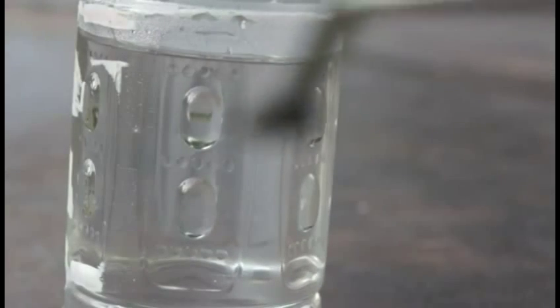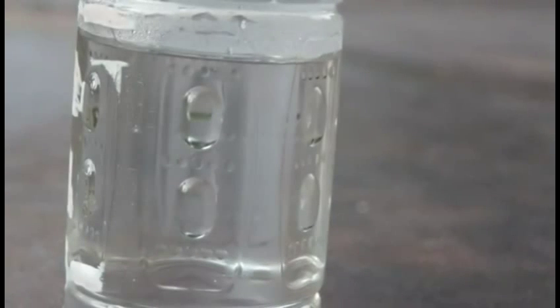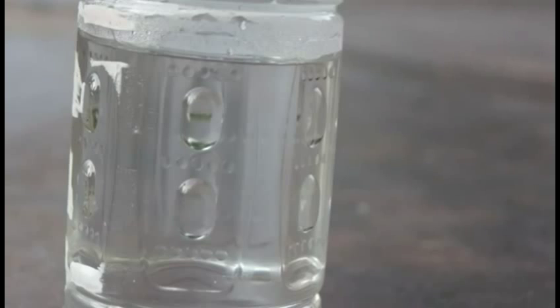Trying to get the camera to focus. Oh well. So, strontium and water.